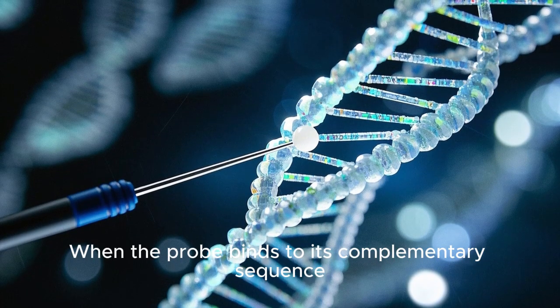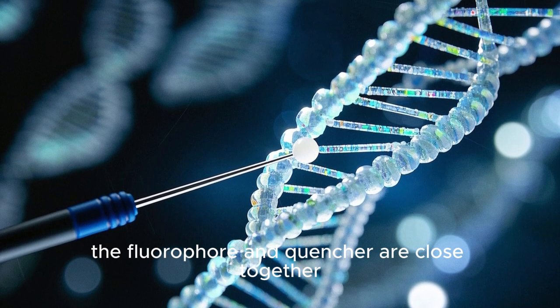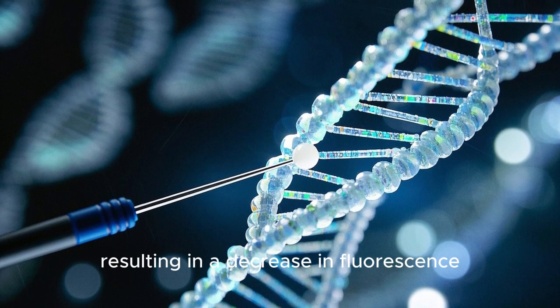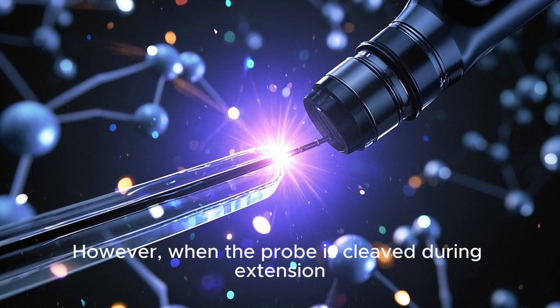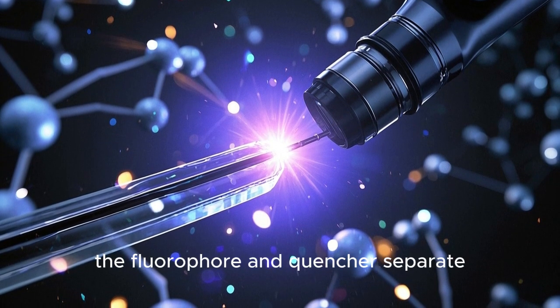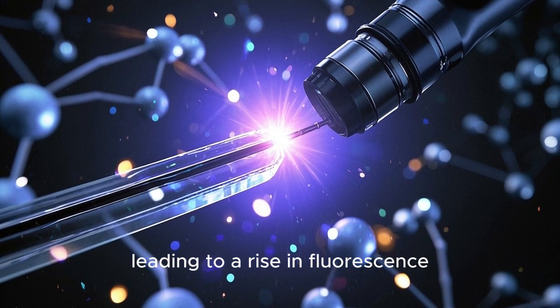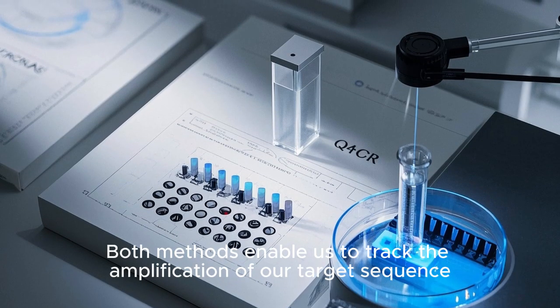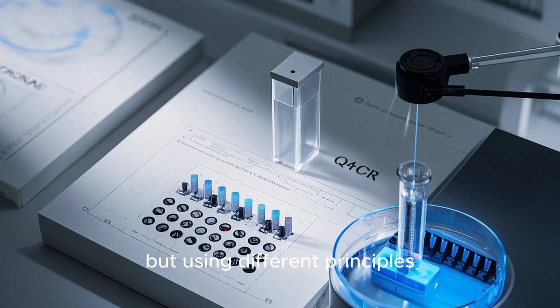When the probe binds to its complementary sequence, the fluorophore and quencher are close together, resulting in a decrease in fluorescence. However, when the probe is cleaved during extension, the fluorophore and quencher separate, leading to a rise in fluorescence. Both methods enable us to track the amplification of our target sequence, but using different principles.